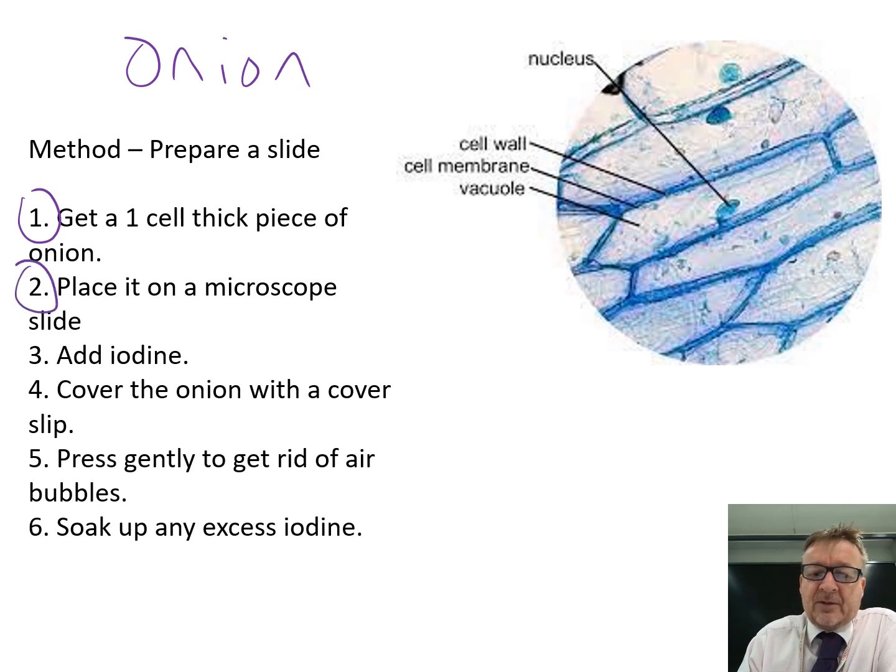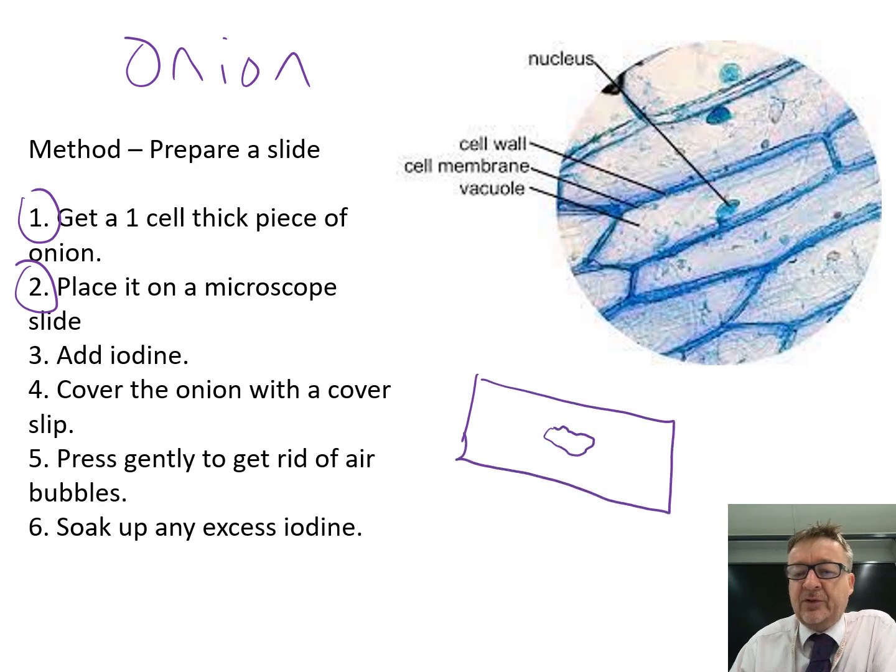Place that thin piece on the microscope slide, making sure it's not folded over, because if it's folded the image won't be very good. Then put it straight in the middle of the slide.